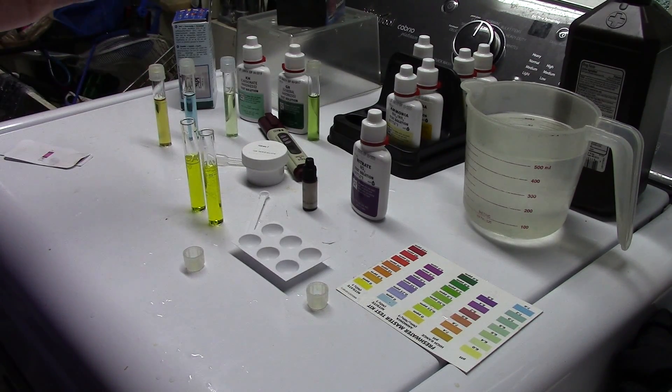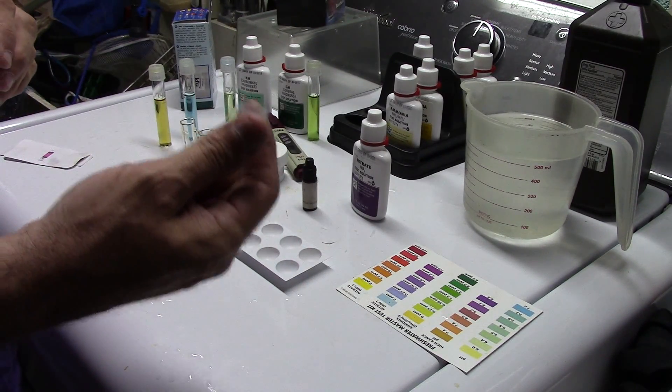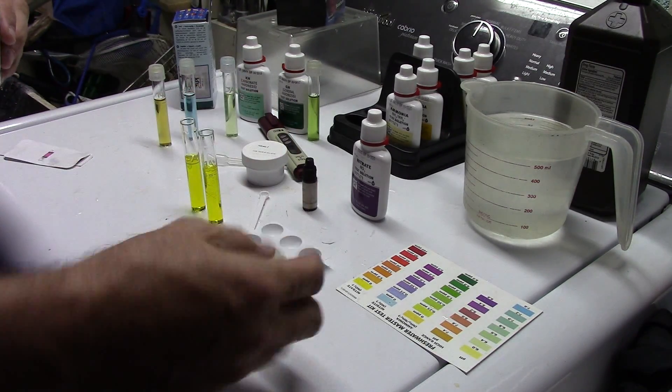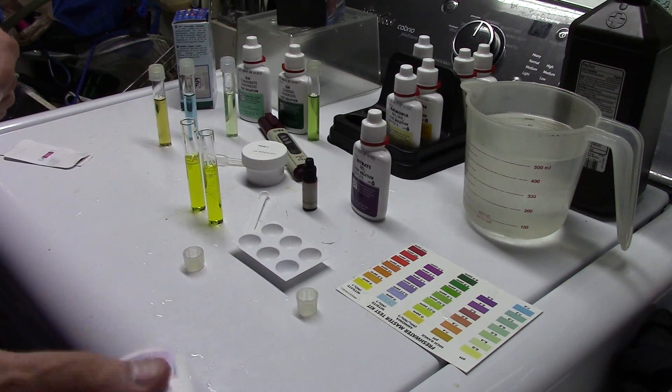I was taught how to do this test by inverting it and not shaking. The reason I inverted and not shook it is because first of all you should always use these caps and not your finger, but they're not super tight seals, and when you shake vigorously you tend to get a lot of this stuff on you and on the outside of the vial.